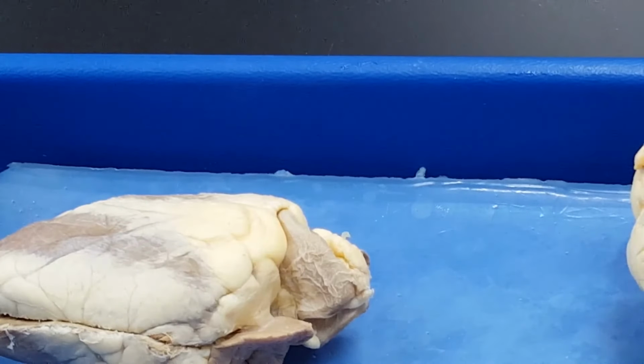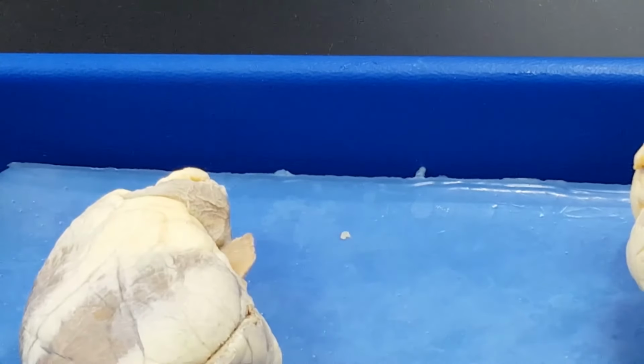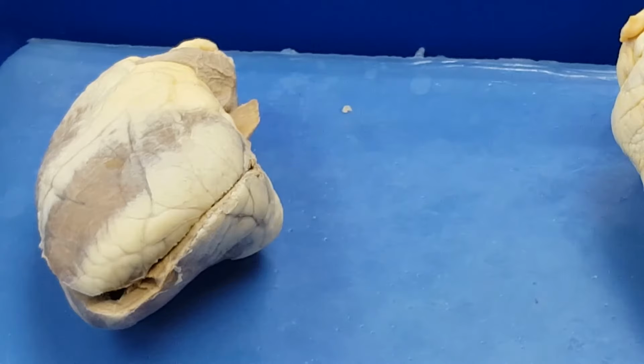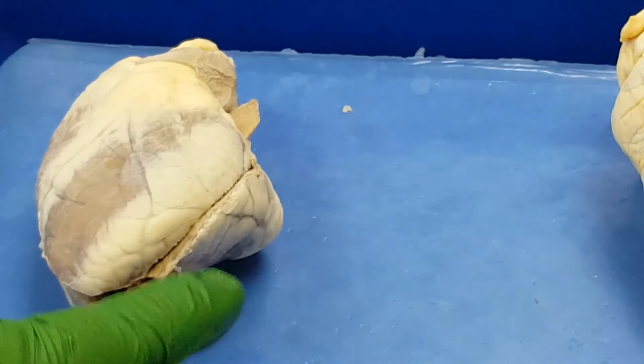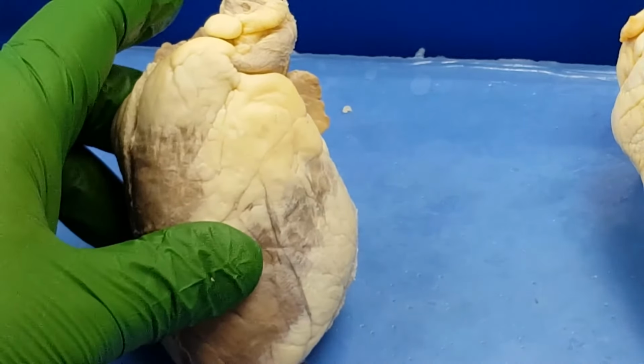It can be very, very difficult to find some of these great vessels and the valves associated with them, but you might guess it, I do have a technique for this that shows me the great vessels and the associated semilunar valves.